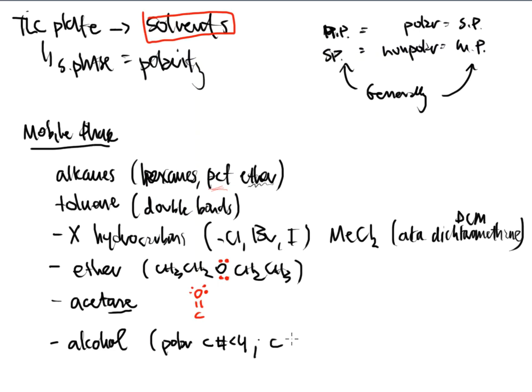However, if you have carbon numbers that are greater than 5, this is another one of those things that you should have learned in organic. These things become non-polar. They're more organic in nature now. So I'm not saying that the polarity goes away. It's still present. But these alcohols are not as polar as the first 4 carbons. The polarity changes quite a bit when you reach the pentane or the pentanol mark and go pentanol, hexanol, heptanol, octanol, and so on.